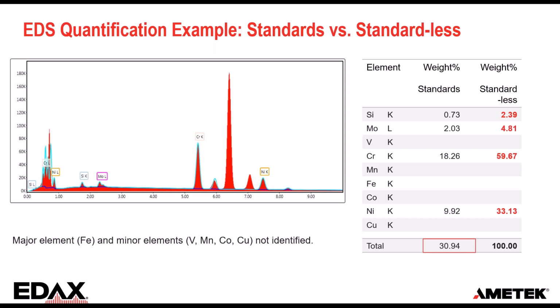And from the measurement itself, if you only have the standardless quantification results, you do not directly see that something is missing if you do not pay attention, of course, to your spectrum.